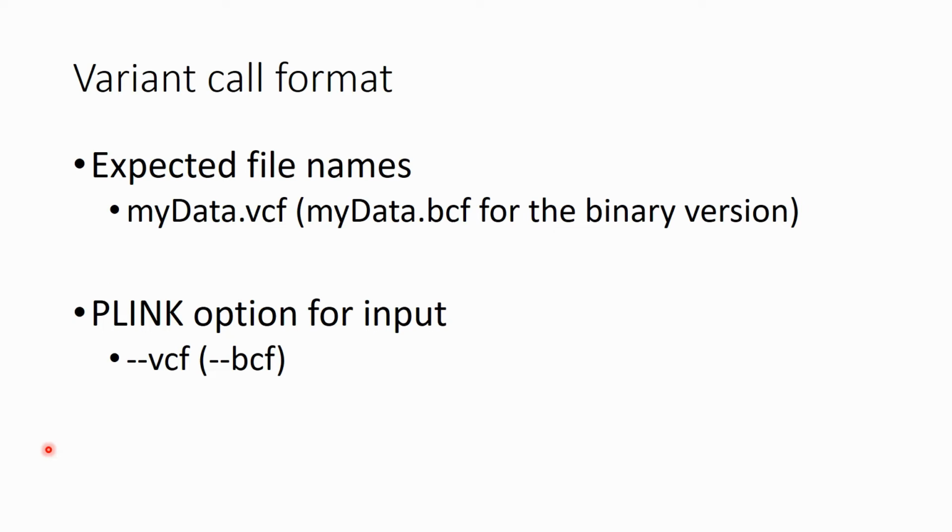The next option, which is also very prominent and very convenient, especially if you work with whole genome sequence data, is the so-called variant call format, or the .vcf files. Indeed, the VCF files could be directly loaded into PLINK.